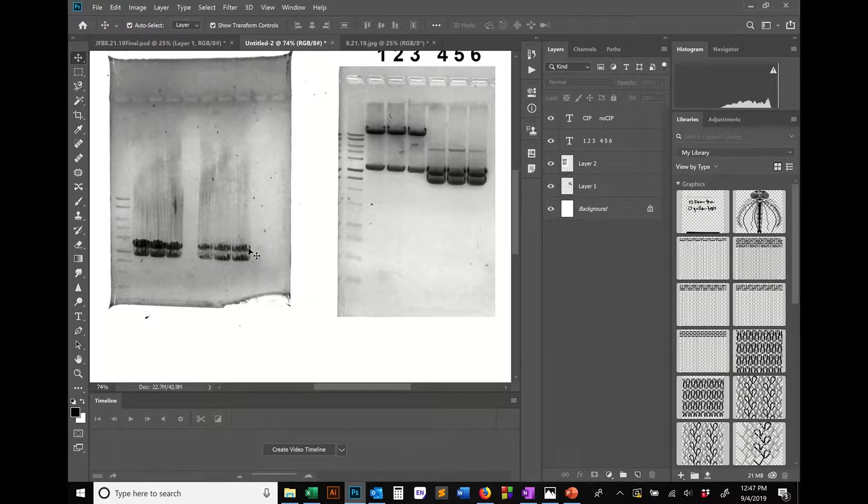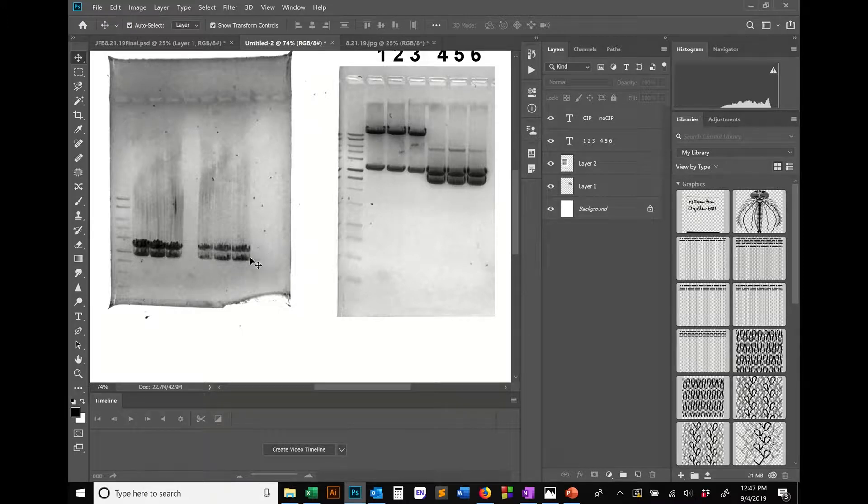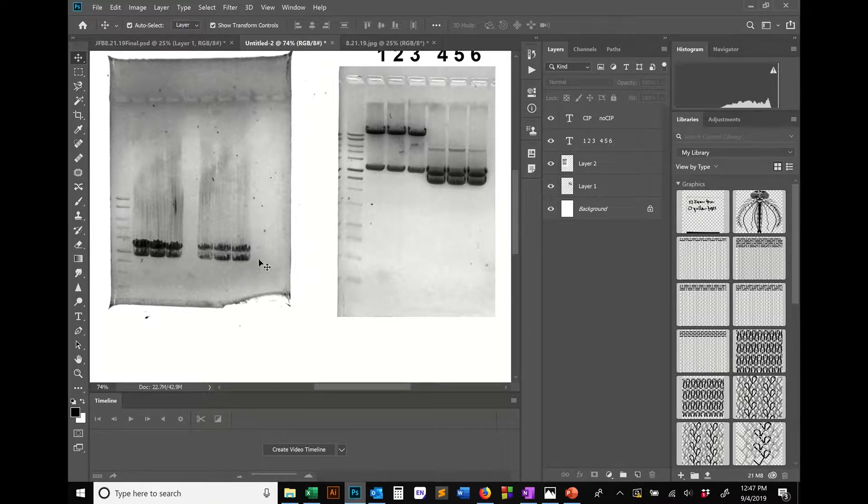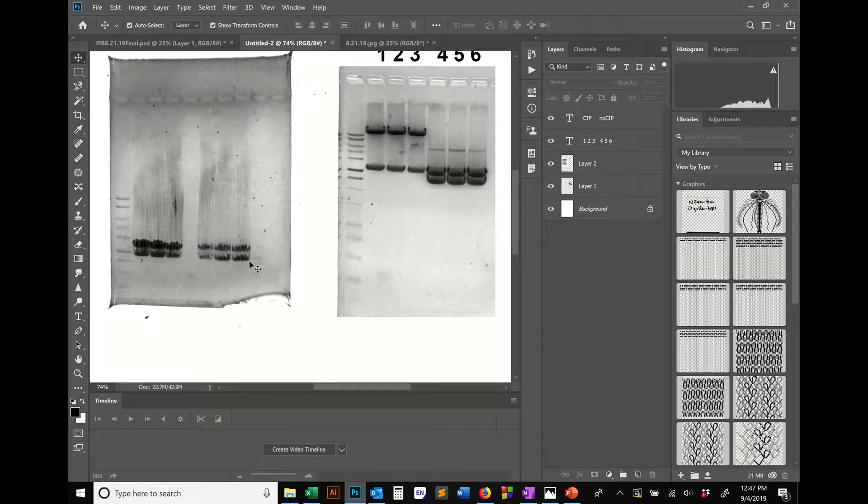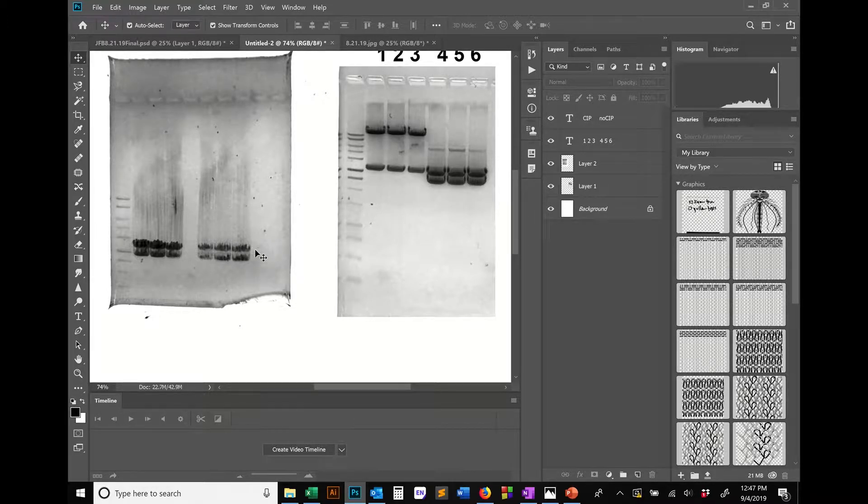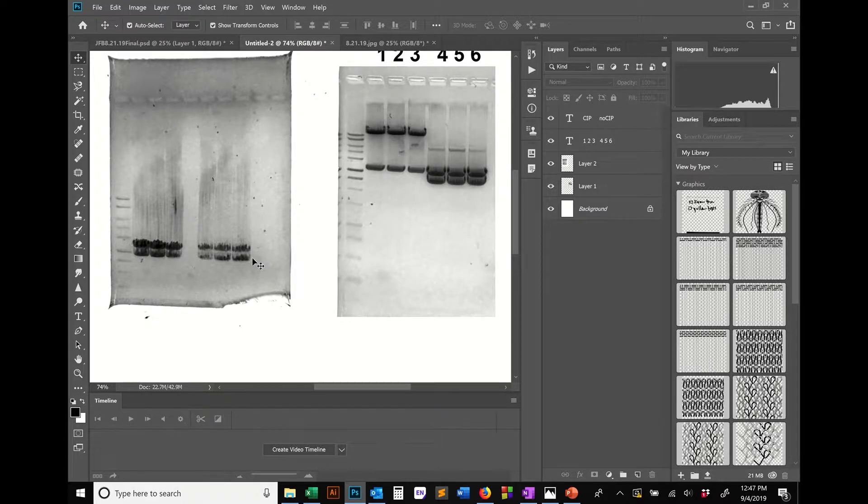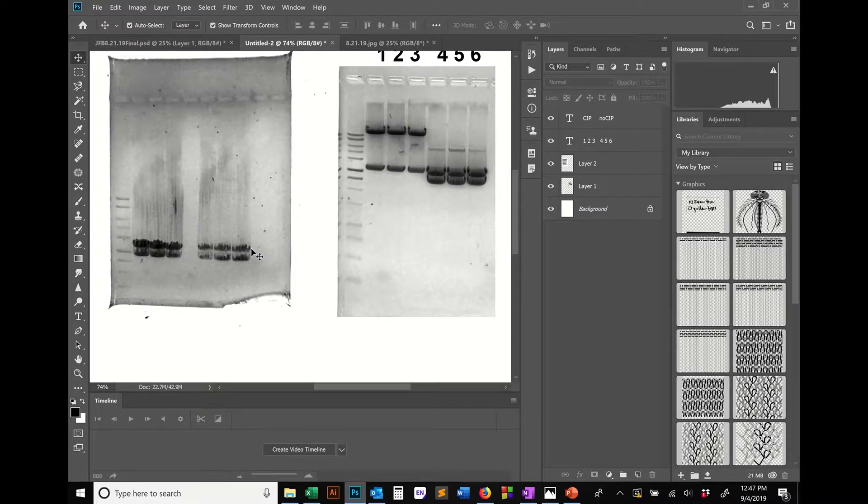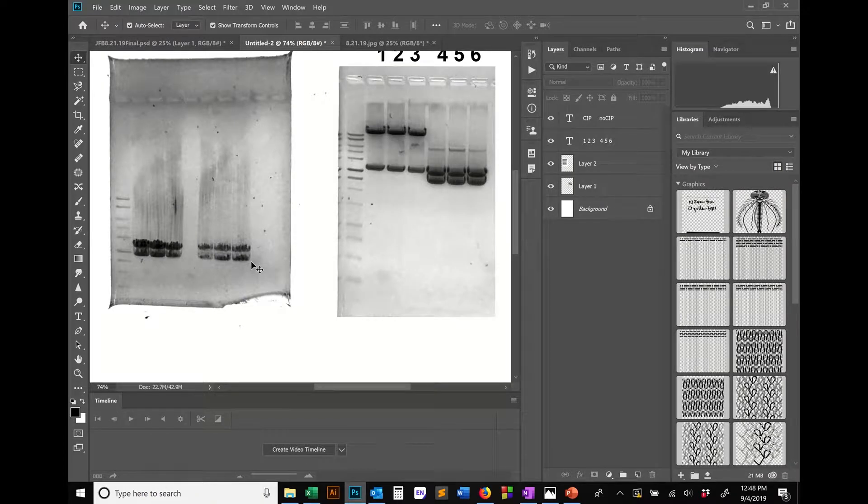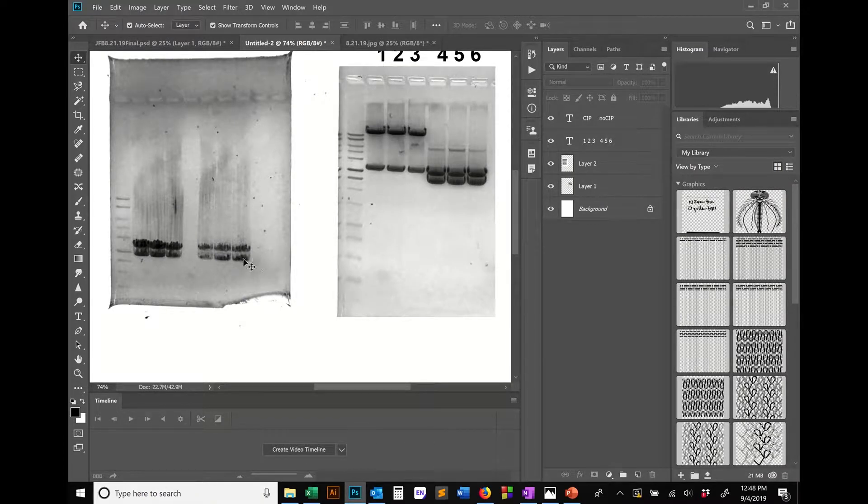The top band is my insert, and the bottom band is the plasmid that it was in, that I'm trying to get it out of and put it in a different plasmid. One of the problems that I was encountering is the insert is actually very close in size to the actual plasmid. So the insert is about 3,200 base pairs, and the plasmid is actually 2,700 base pairs, so they're pretty close in size.